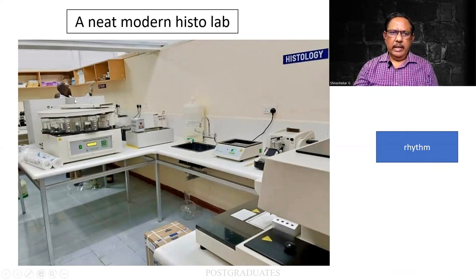There is a machine called the Histokinette. The processing is going on, after which I find that there is a water bath and other things. Section cutting is going to go on at this station, and probably there is the hot and the cold. Probably the embedding will be going on, and finally you get the slide out. So this is a beautiful one.